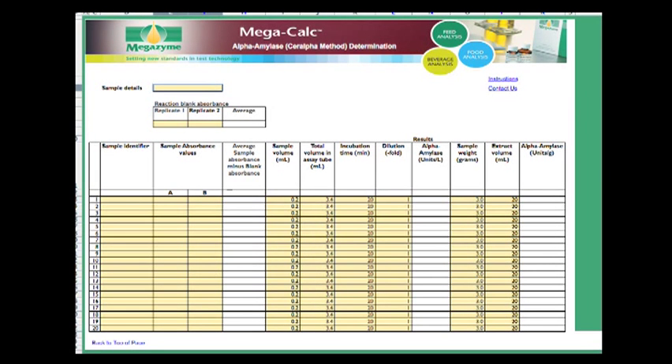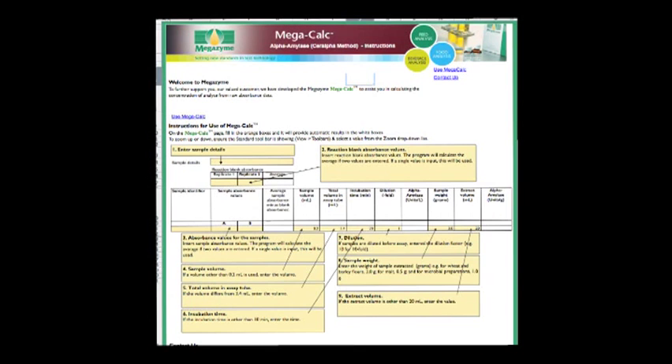Calculation of alpha-amylase activity can be simplified using the MegaCalc XL calculation device as shown in this slide. Basically, data is entered into the yellow colored boxes and the calculator calculates the specific activities. The specific details on how to use the calculator are summarised in this slide, where it shows where to enter sample details, the absorbance values to be added, if you wish to change the sample volume or total volume, and it also shows how the basic calculation is done.